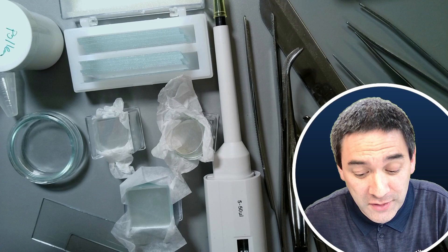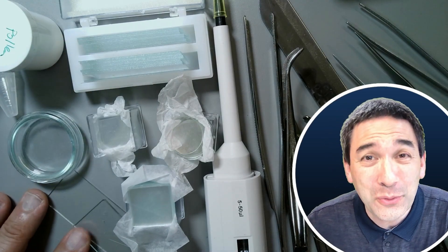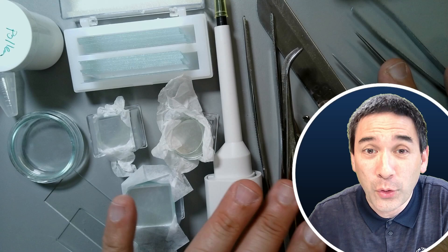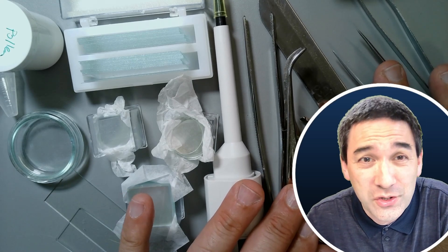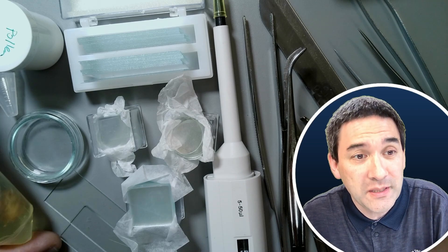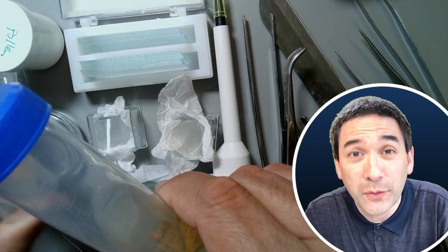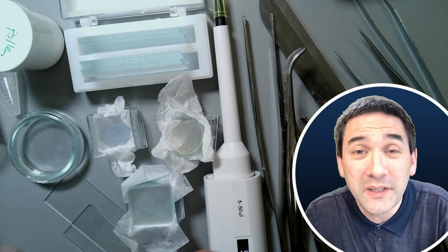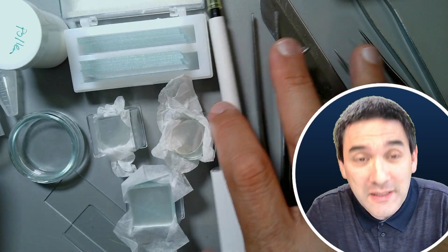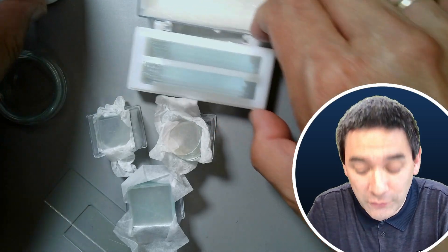First of all, I'll talk about the cover glasses and microscope slides. I think these are the most important accessories. Then, of course, a few tools here: tweezers, scissors, pipettes. And last but not least, I have some containers for storing your samples. Let's clear up the mess and start with the microscope slides and cover glasses.